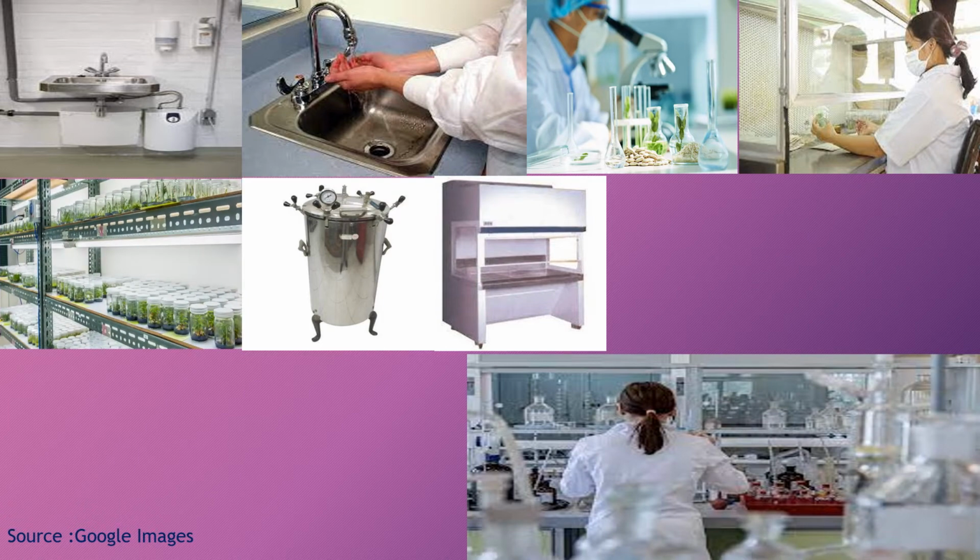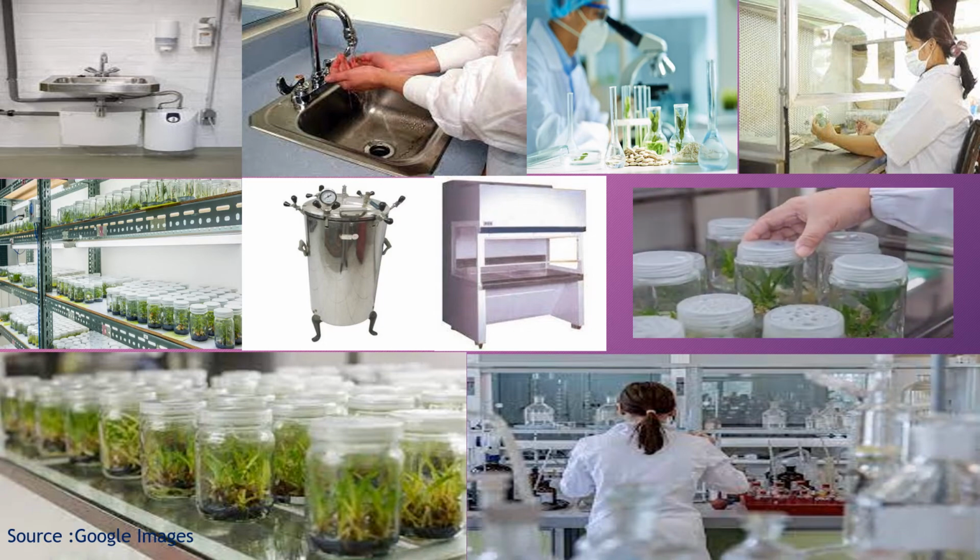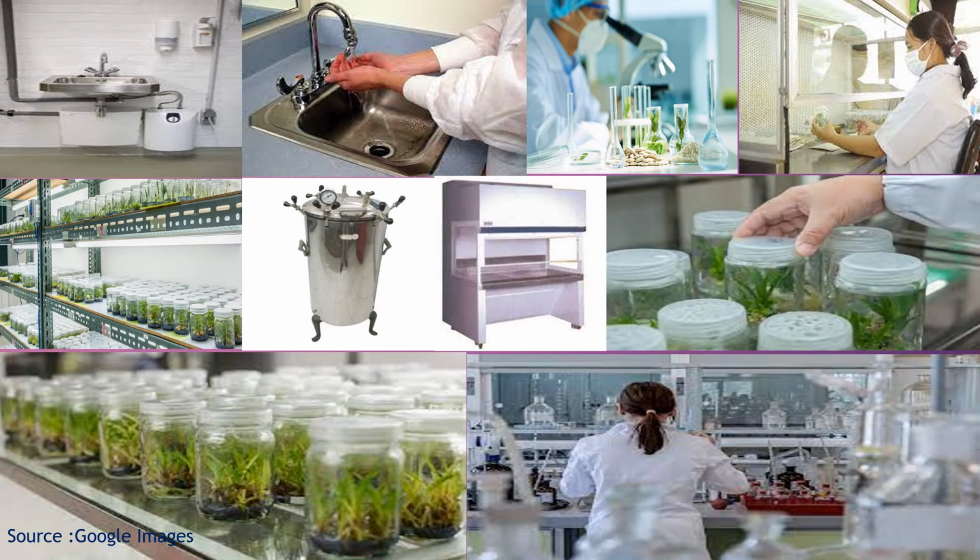So here you can see the well illuminated shooting area where the callus will be allowed to go in for organogenesis, for the shoot formation, and here you can see the root formation, and ultimately you can see the glass vials. They are actually big bottles inside which the plants have been grown for plant tissue culture. Then we go for acclimatization and then hardening, and then we'll plant them in the field.